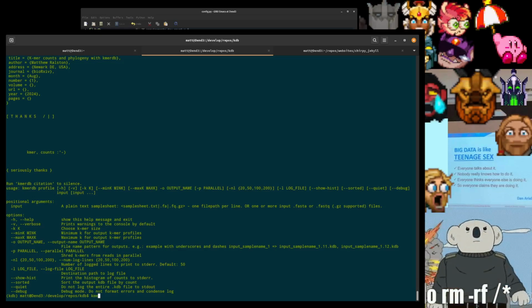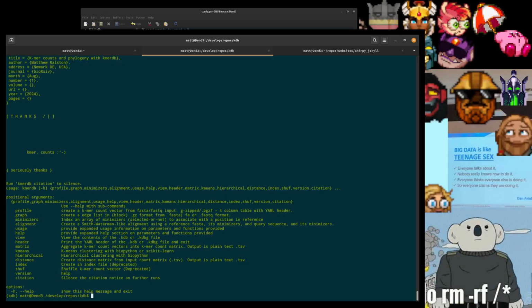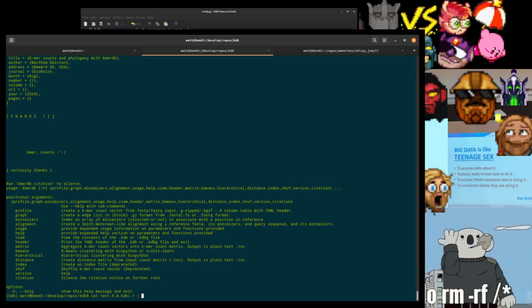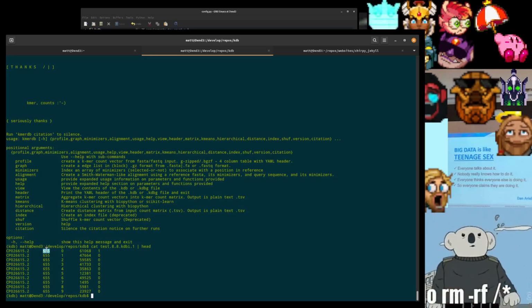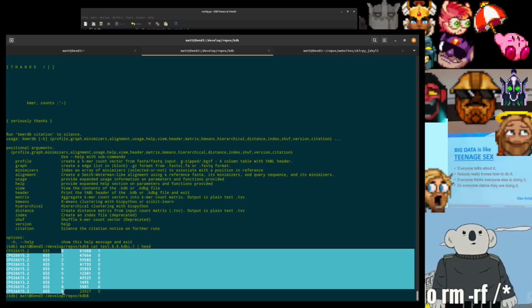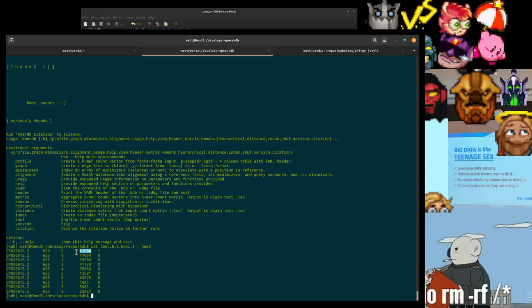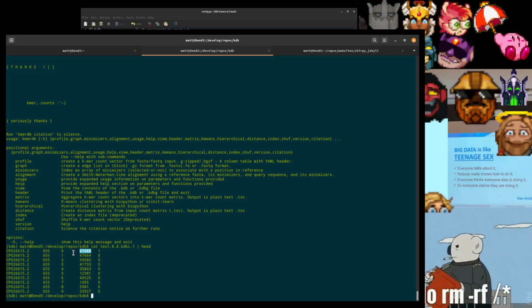Anyway, so we're kind of getting away from the point here. Here's an example of the minimizer file. So this is the chromosome name. This is the length of that chromosome. This is a kmer ID within that chromosome, so really the sequence position. This is the kmer ID of the kmer at that point in that chromosome.